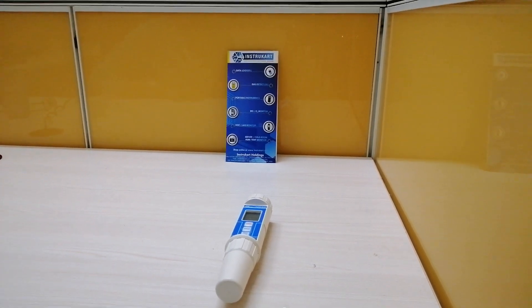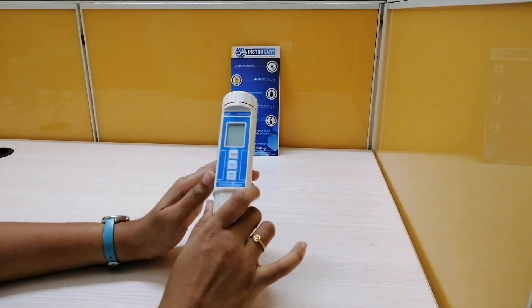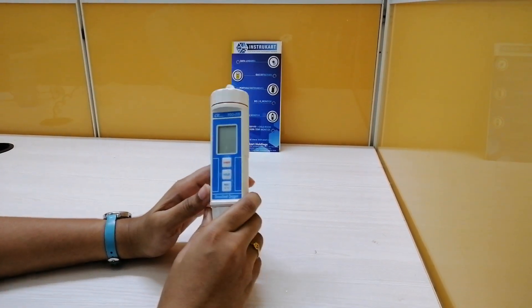Hello all, welcome to Instruport Holdings, your worldwide instrument partner. Today I am going to walk you through the product PDO-519 Dissolved Oxygen Meter.